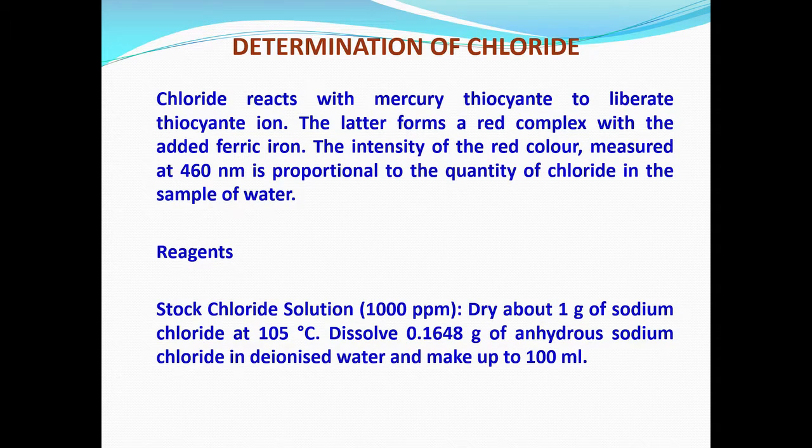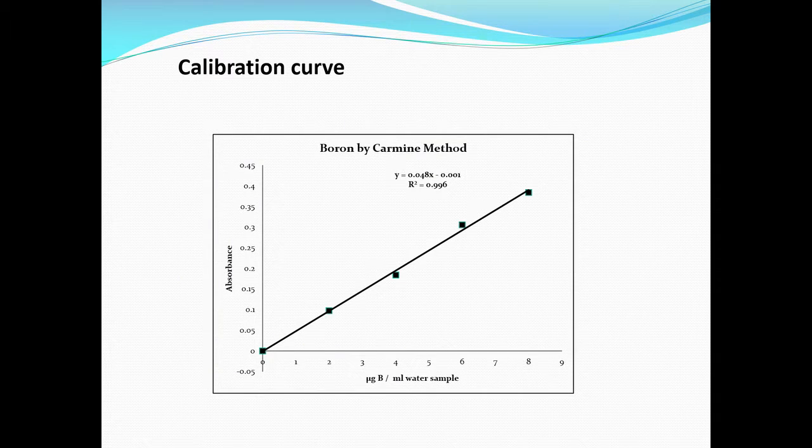Now, we do have certain information about the pollution, about the interferences of other metals, that we will take a look at as and when we require. For the time being, what I would like you to do is, if you are able to understand all the nuances, and if you have a spectrophotometer at your disposal at 585 nanometers, you go ahead and do this, and you will be able to determine boron from 1 to 8 ppm, and that is the range in which you will find most of the water bodies in India, approximately showing you the concentrations in their matrix.